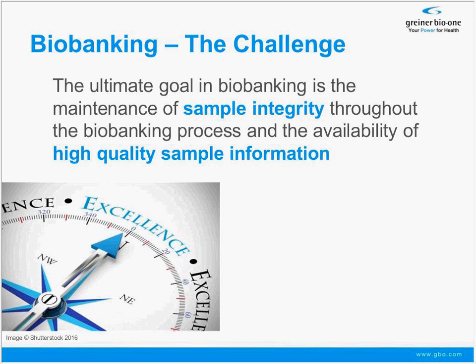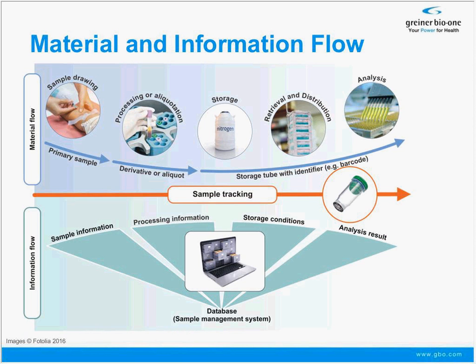goal, and I guess you as the biobankers, as the users may agree, the ultimate goal in biobanking being the maintenance of sample integrity and also the maintenance of high sample information over the entire process of the biobanking workflow. That means that starting from acquisition of a sample through storage and through release of a sample towards an end user, sample integrity and high quality of sample information is a must.